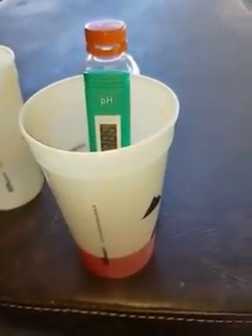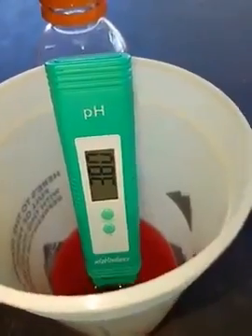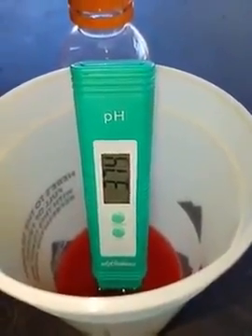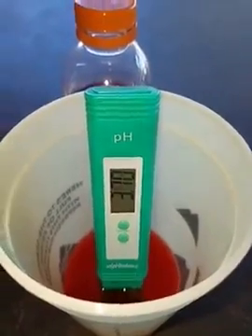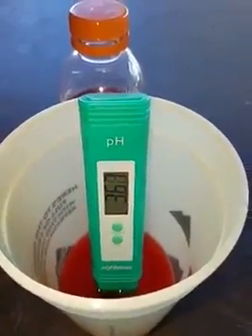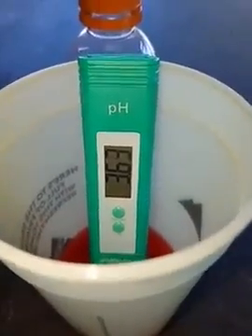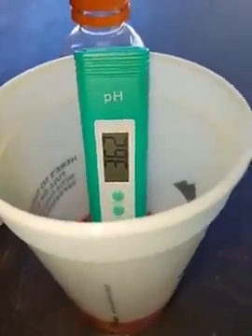So it's at 3.85, and it keeps going down. As you can see, it's not quite stabilized yet. It just keeps on slowly going down. Nope, hasn't hit its stabilization point yet. Oh, is that it? Nope, still going down. So obviously it takes more than a minute for Gatorade to stabilize at a pH level. But as you can see, it does work right there.